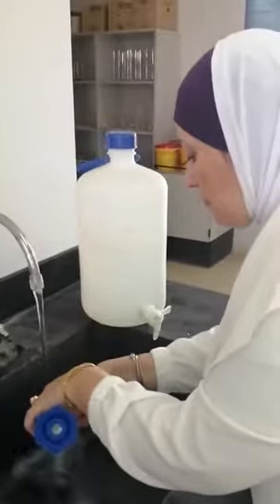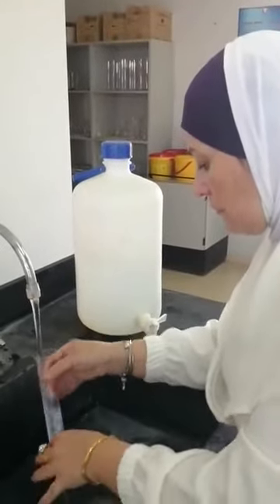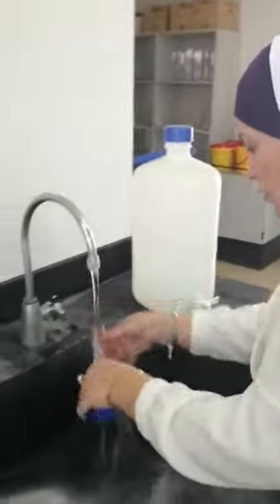The fourth step, we have to discard the powder. I need the drying tissue, please.